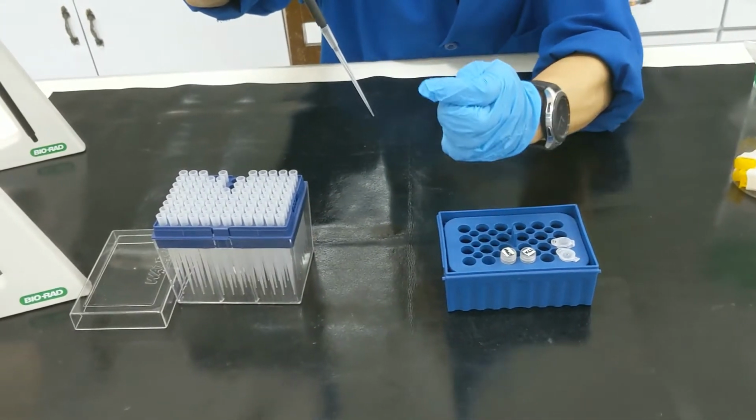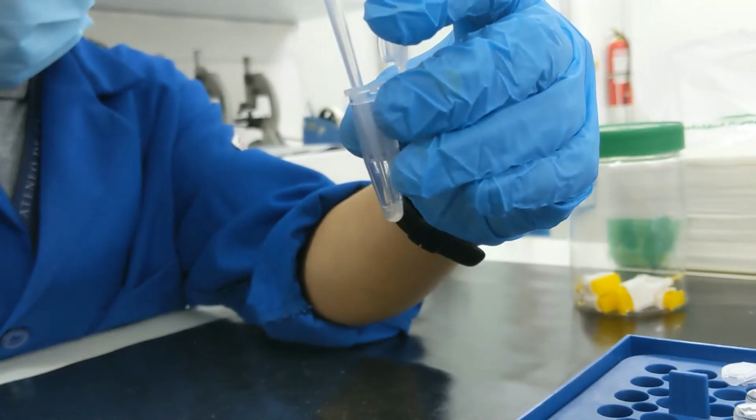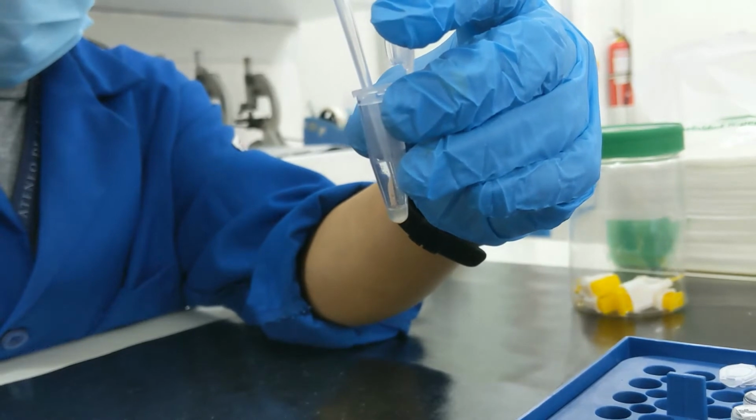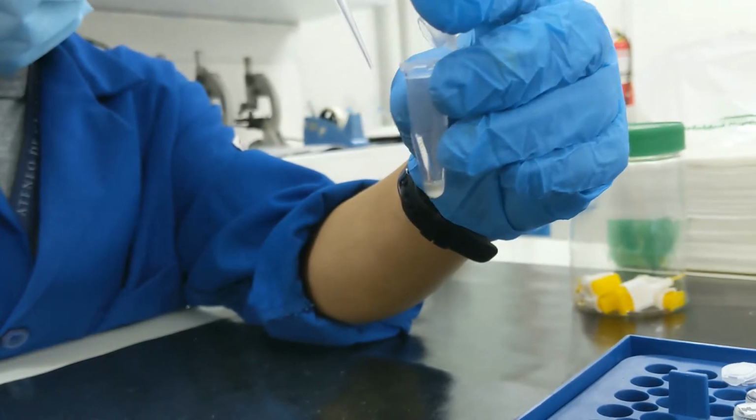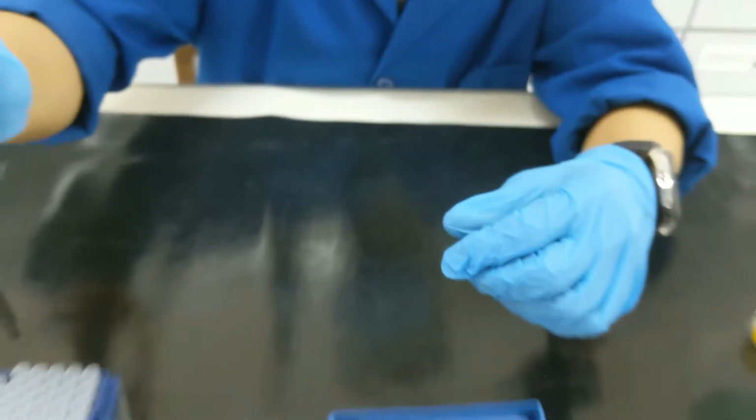And here we continue removing the serum. And here is now our complete serum for SDS-PAGE later on.